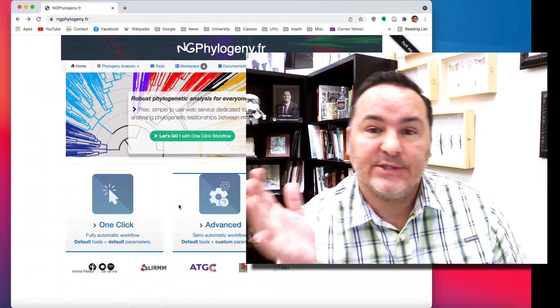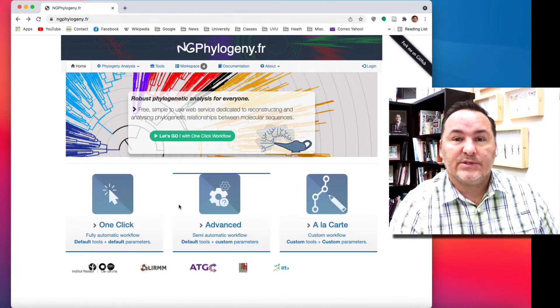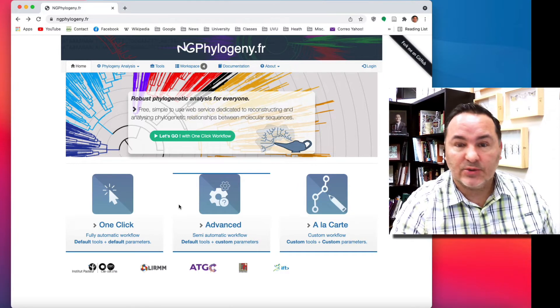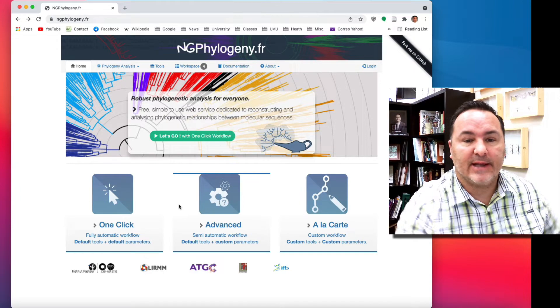Hi, in this video we're going to learn just a little bit about how to use this website called ngphylogeny.fr, which is a website that allows you to do different kinds of phylogenetic analyses.